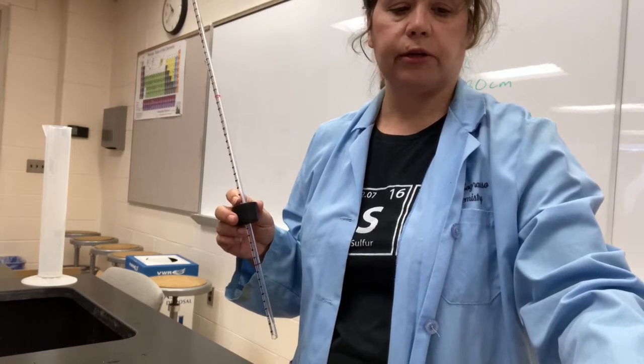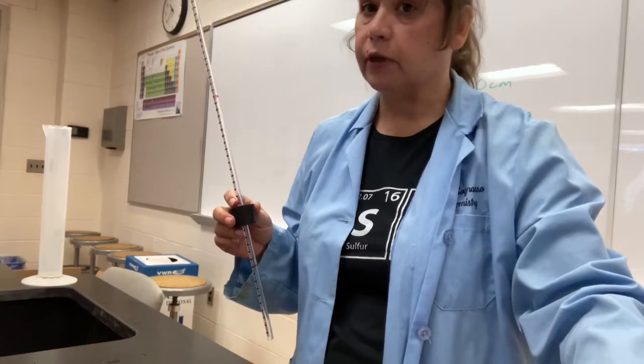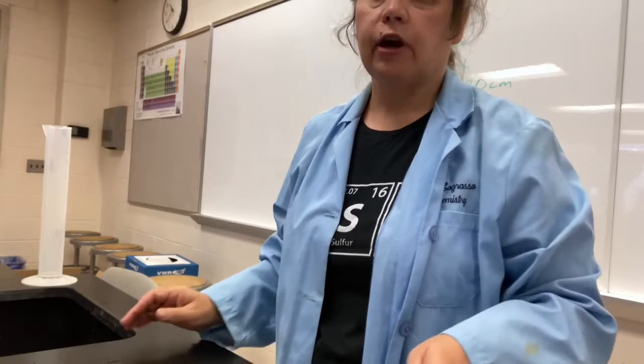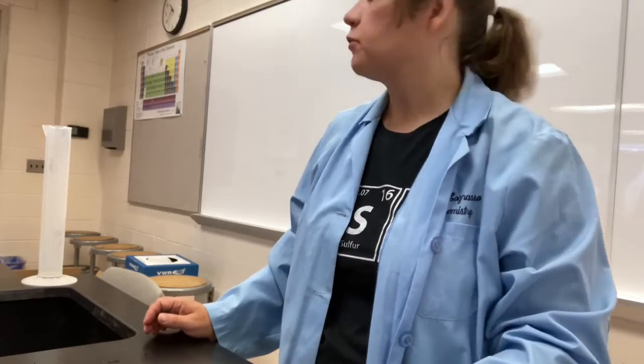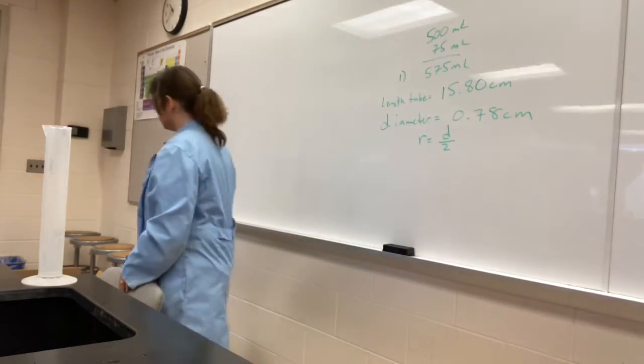So you will go ahead and subtract the line 4, and then you're going to subtract another 50 milliliters because of the 50 milliliters of water in the flask. Now the other item that you're going to need to know is the atmospheric pressure. So you'll see line 6 asks for the atmospheric pressure. So we have a barometer here in the classroom. Let me go see what it says.